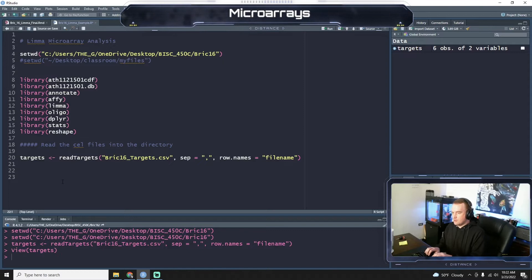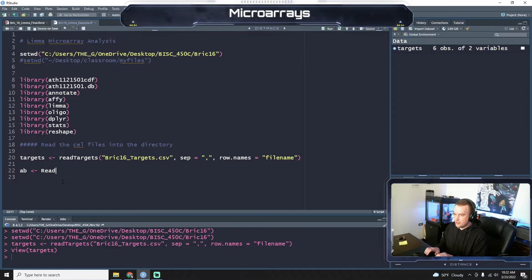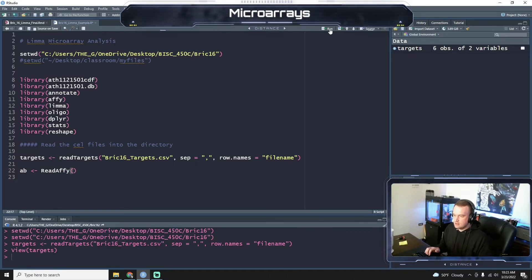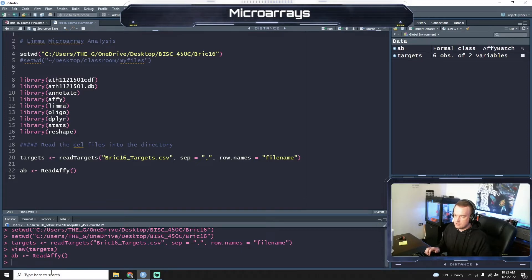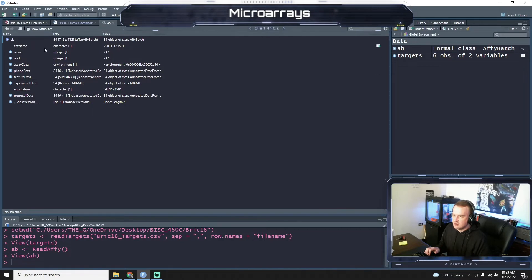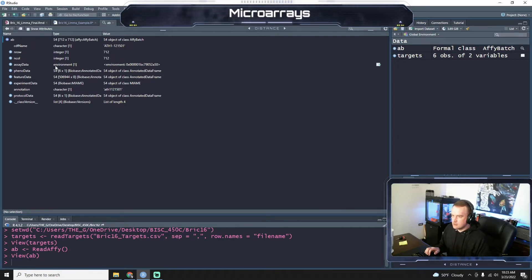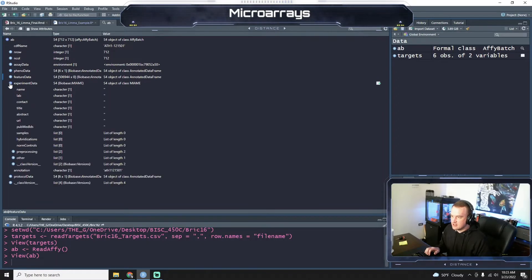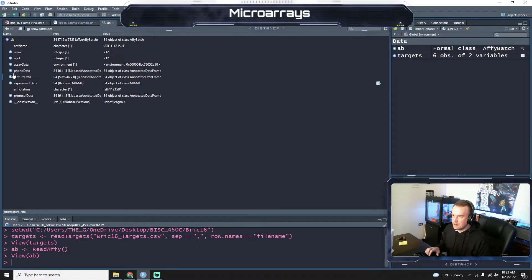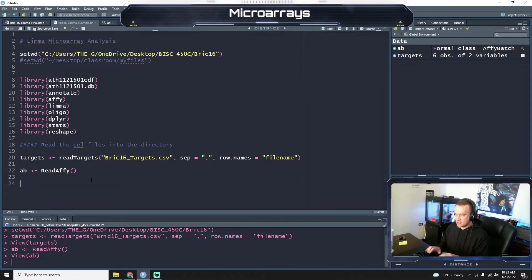And now what we're going to do is we're going to ReadAffy. Let's call this variable ab. So we have an AffyBatch here where you can see this is just all the Affy data read in from those cell files. So we'll start to process it here in a second.